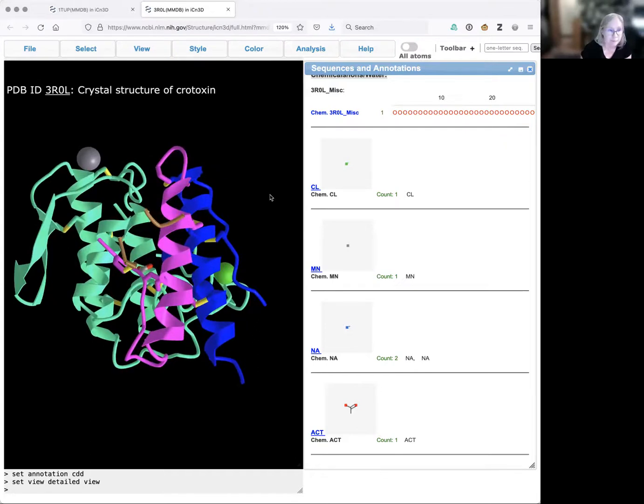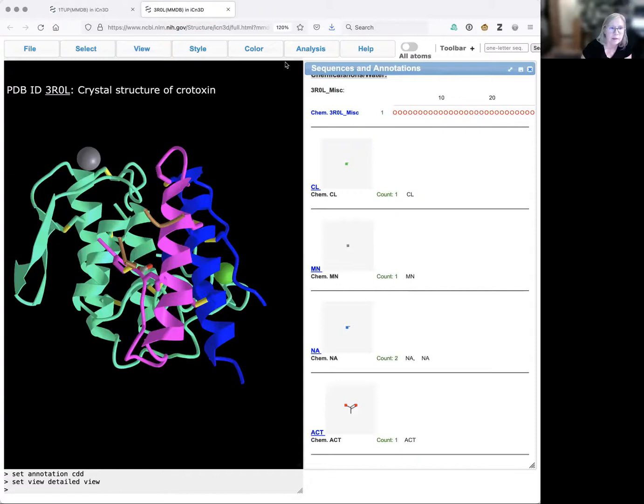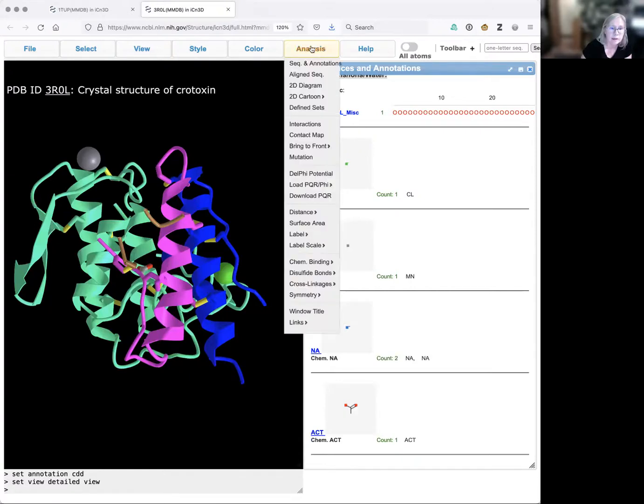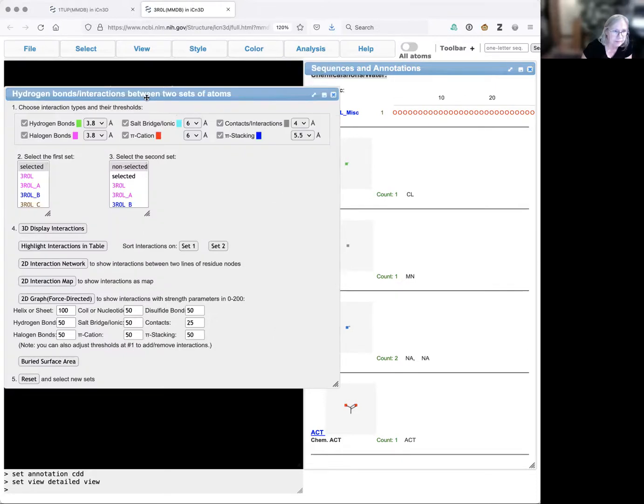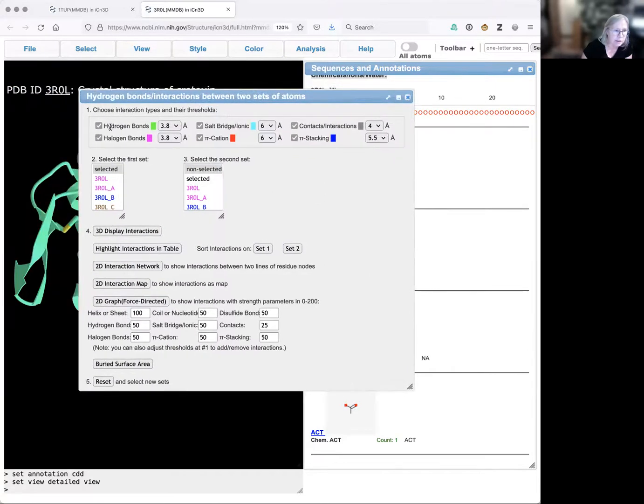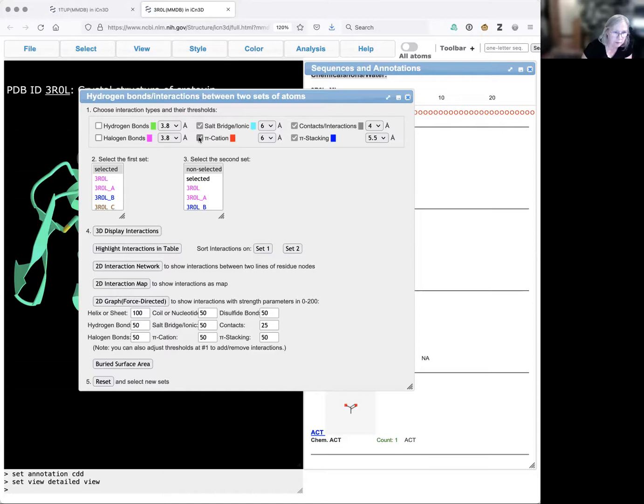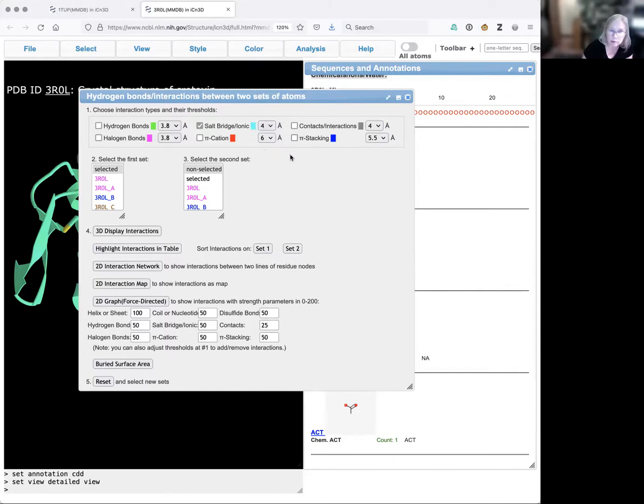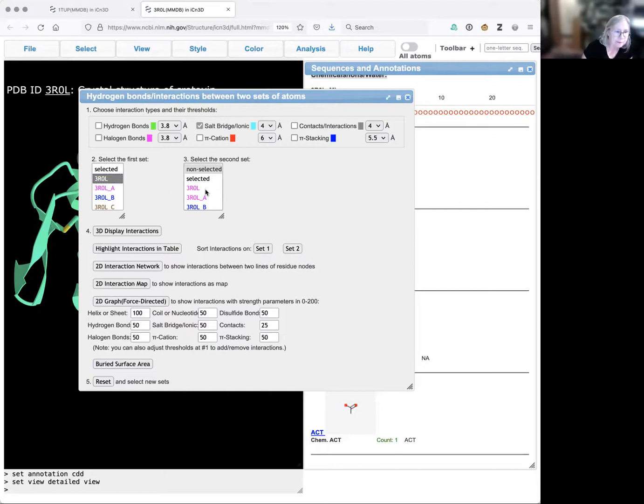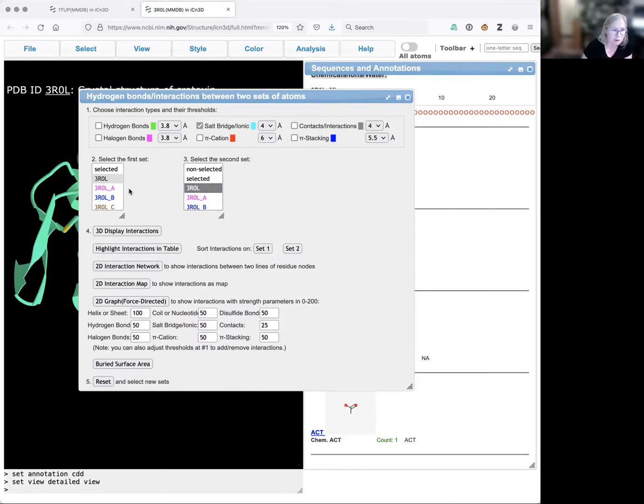To see our salt bridges, we're going to open the analysis menu, choose interactions, and then change the default settings. We don't want to see hydrogen bonds, halogen bonds, pi cations, contacts, or pi stacking. We do want to see salt bridges, but we're going to change this to 4. These numbers stand for angstroms, so we're looking for things that are 4 angstroms or less apart. I'm going to pick my ID for my structure to find all the ionic bonds or salt bridges in the structure.